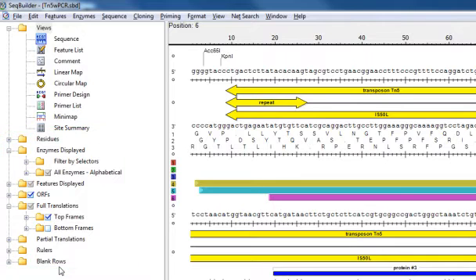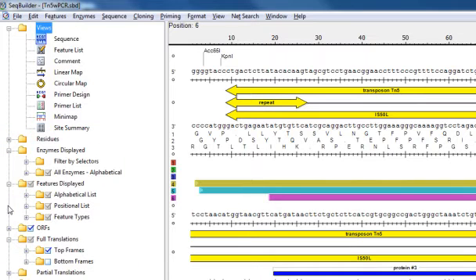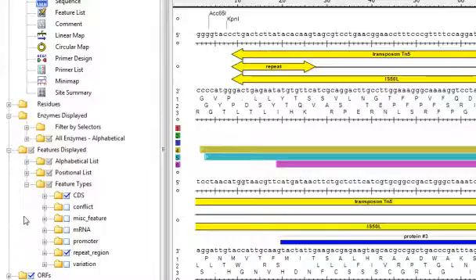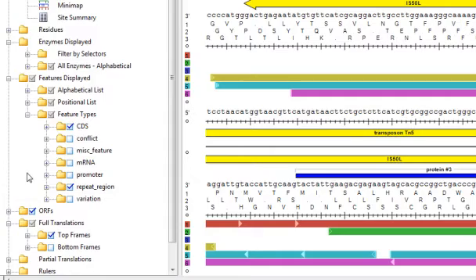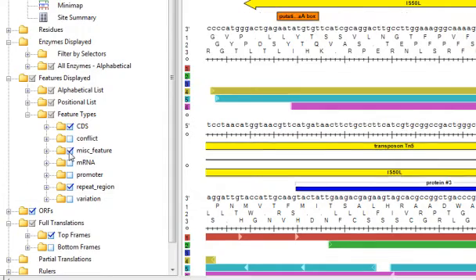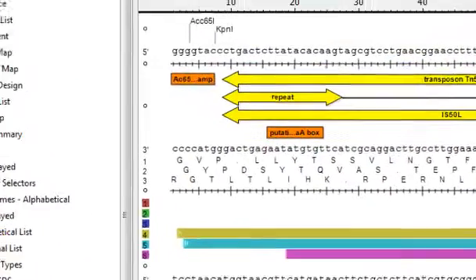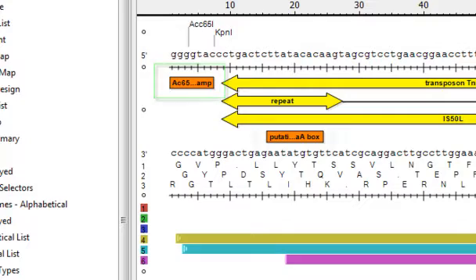For example, if I open up the Features Displayed folder, you can see that right now I'm only displaying CDS and repeat region features. But if I also wanted to display miscellaneous features, I could just select this box, and now those are displayed as well.